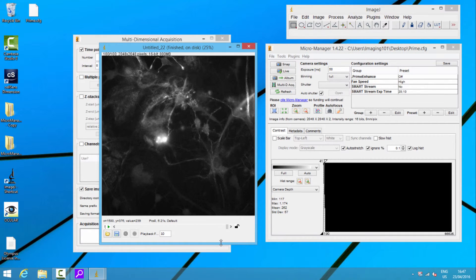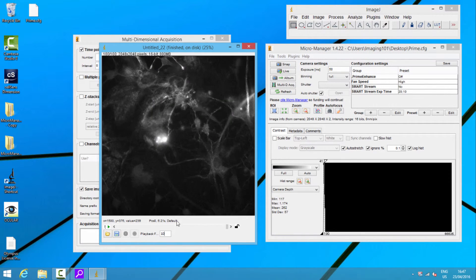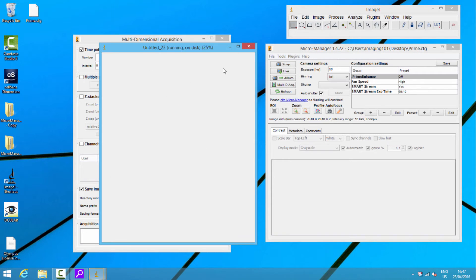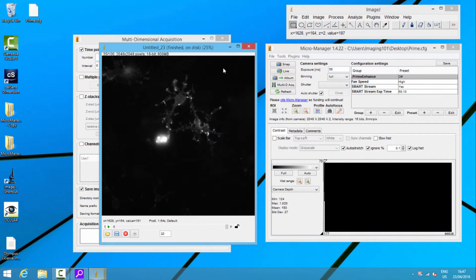It's a little bit slower at 50 milliseconds, but overall it took about six seconds. So 100 images in six seconds — running at about 16.7 frames a second. What we're going to do now is set up smart streaming. We'll go 50 milliseconds and 10 milliseconds, because one channel needs 50 milliseconds and the other one needs 10. This should go a lot faster because we have a shorter cycle time for the overall images.